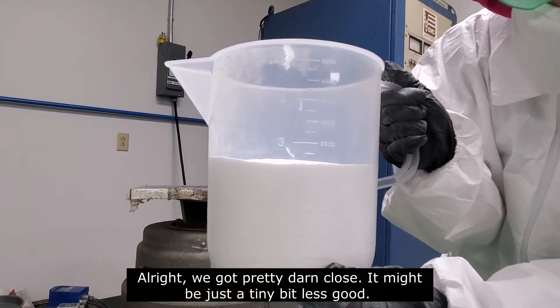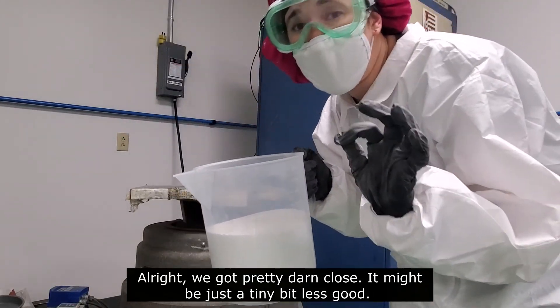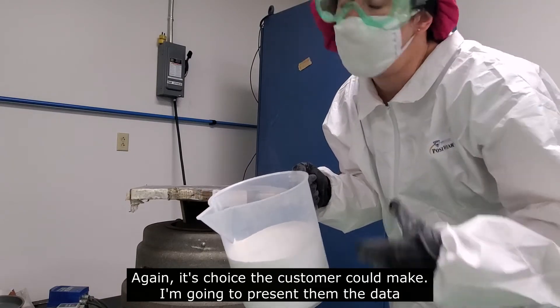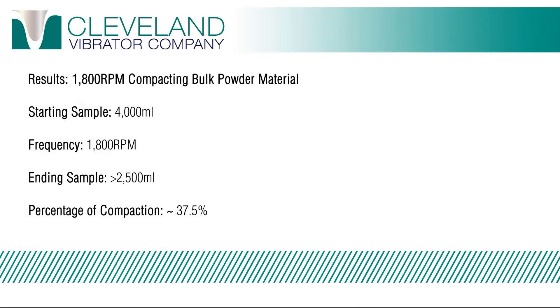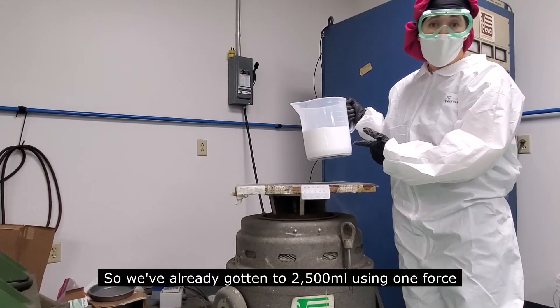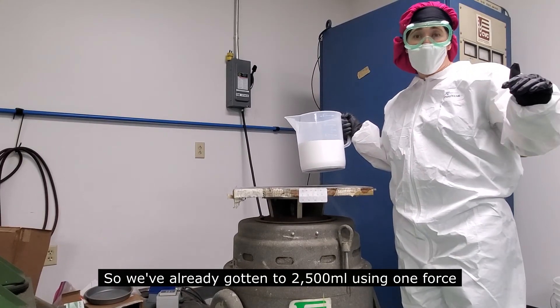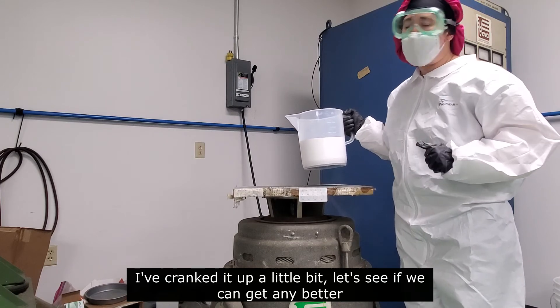We got pretty darn close. It might be just a tiny bit less good. Again, it's a choice the customer can make — I'm going to present them the data. So we've already gotten the 2,500 milliliters using one force. I've cranked it up a little bit. Let's see if we can do any better.